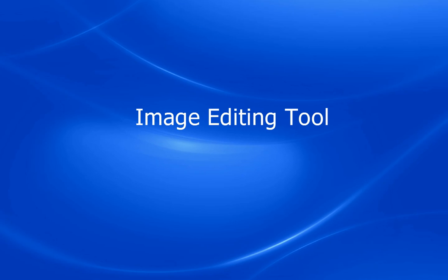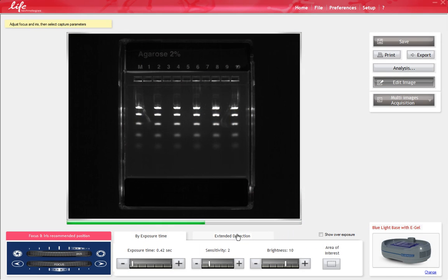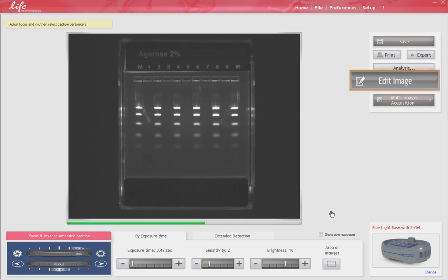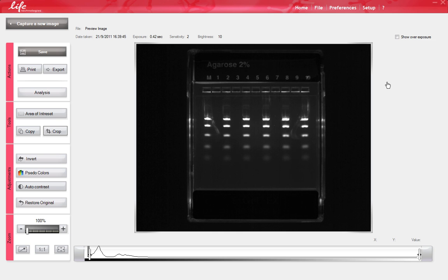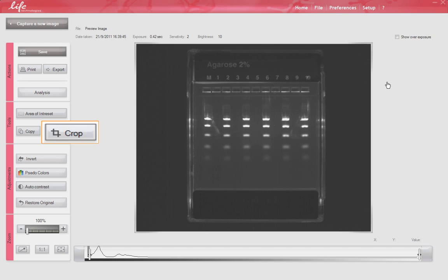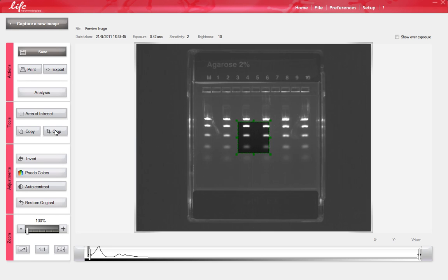To perform advanced applications such as cropping the image or inverting image colors, you can use the Edit Image tool. To edit an image, select the Edit Image tool. You can select the Crop button on the left menu to Crop, Save, or export the important part of your image.